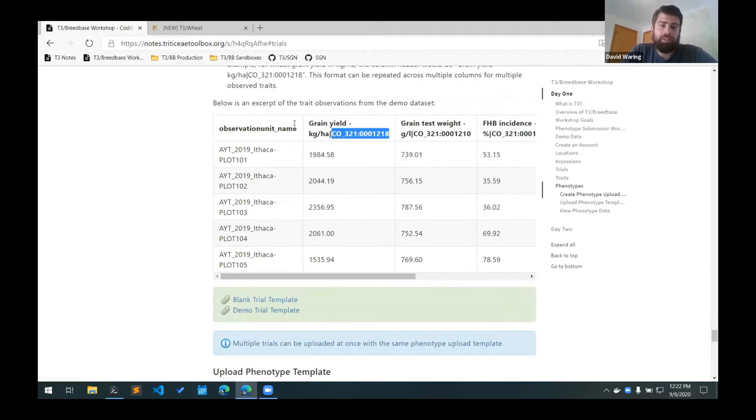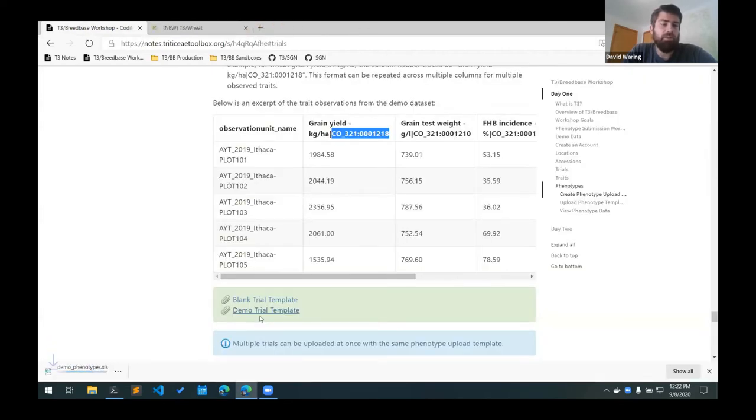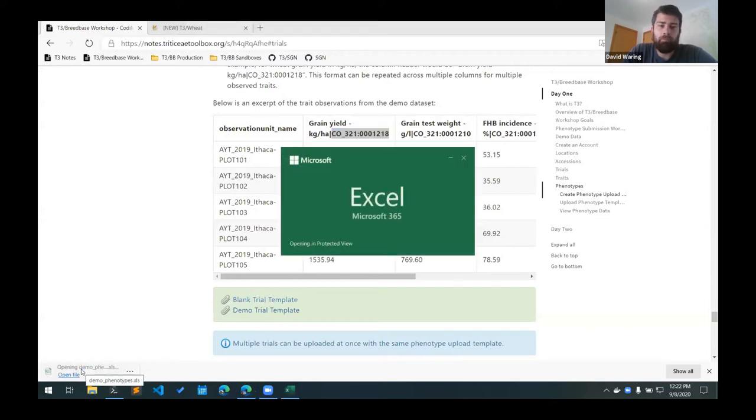So this is just an excerpt of the demo trial template that I created with the sample data set. So we can take a look at that.